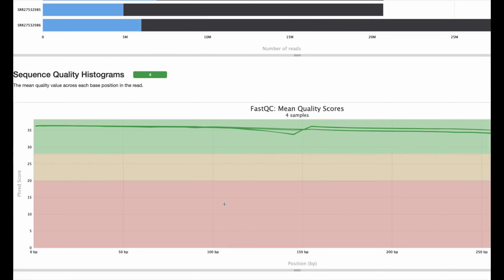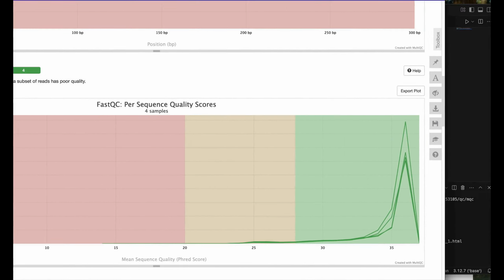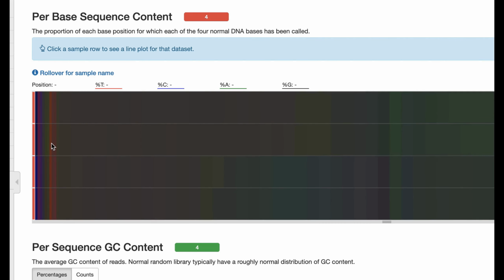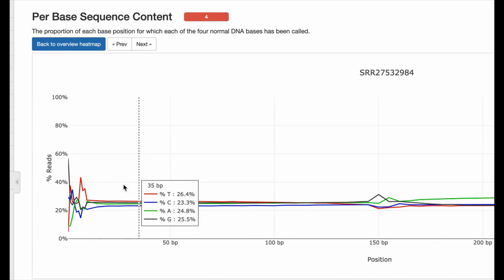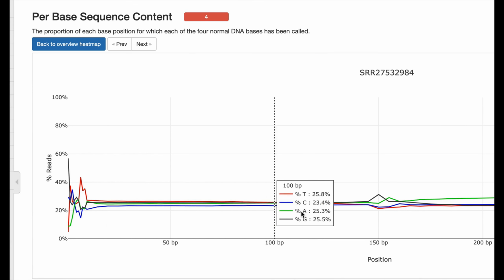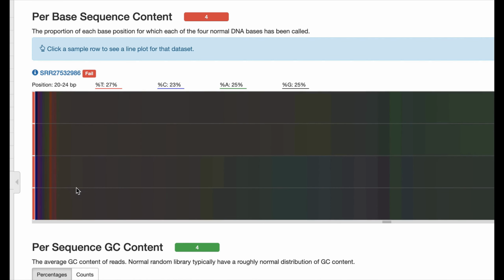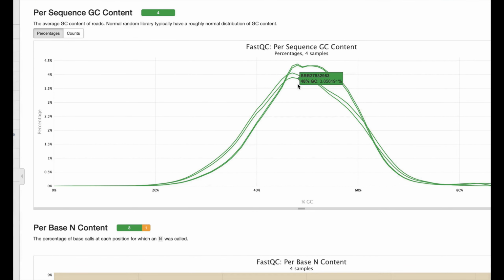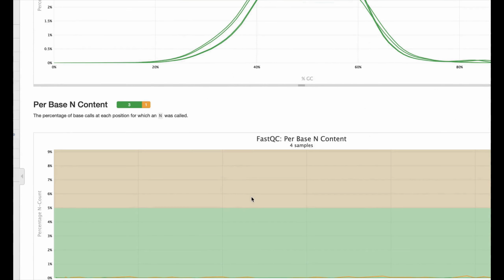You observe the same data for all your samples, but now next to one another, and you can compare things, the quality, etc. Here you can click on a picture and then you will see the more regular line plot, and click back and then it will be a heat map kind of. GC content, as I said, is strangely different upon treatment.